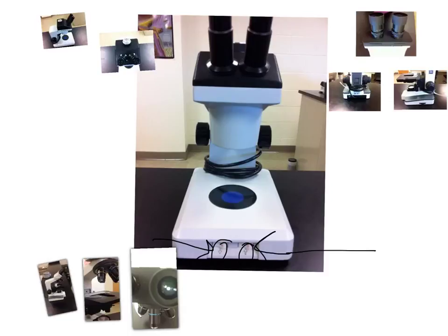If you have an organism that is semi-transparent, you'll be able to illuminate from the bottom up, and it will make things a lot easier to see. If you have something that's pretty solid, such as a tree trunk, like a small twig, or something pretty solid, you're going to want to illuminate from the top down.